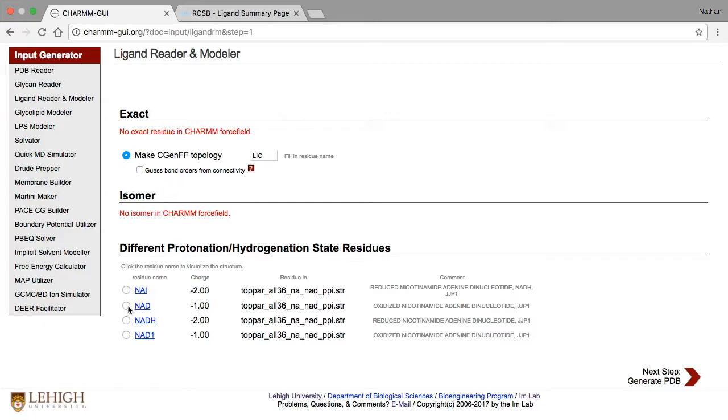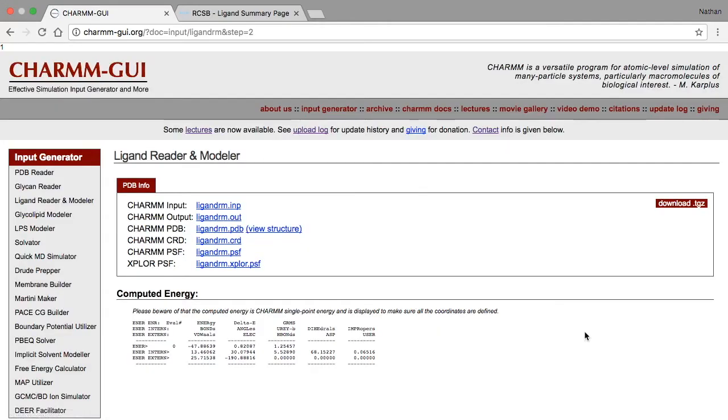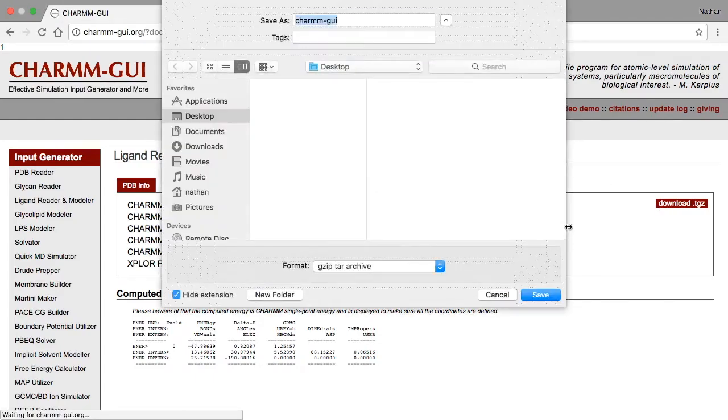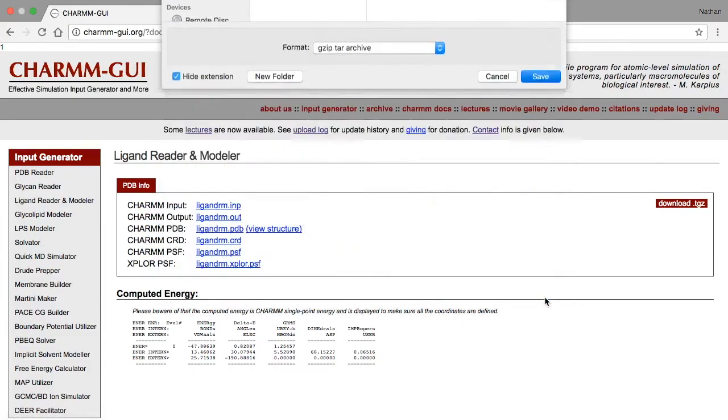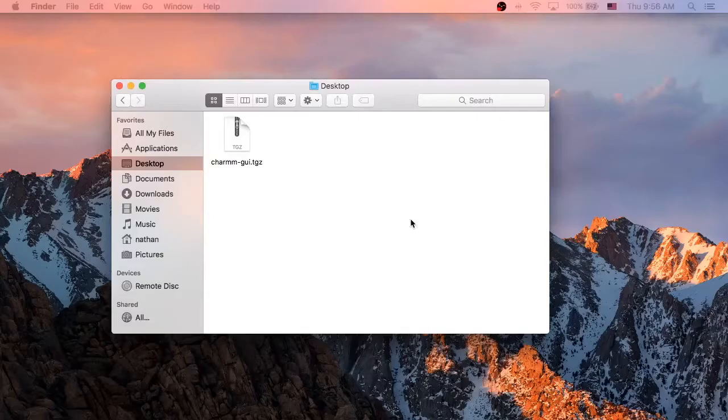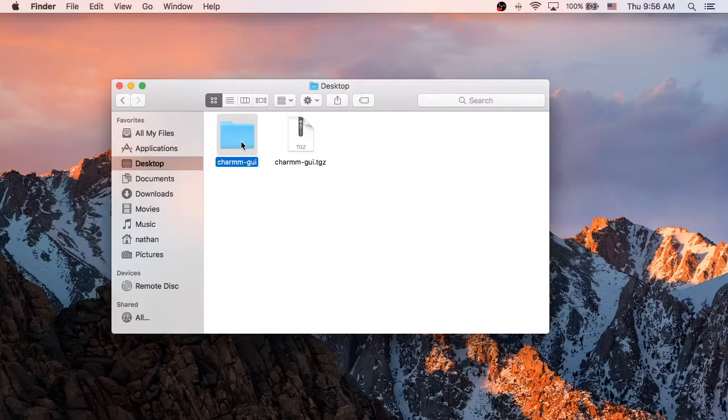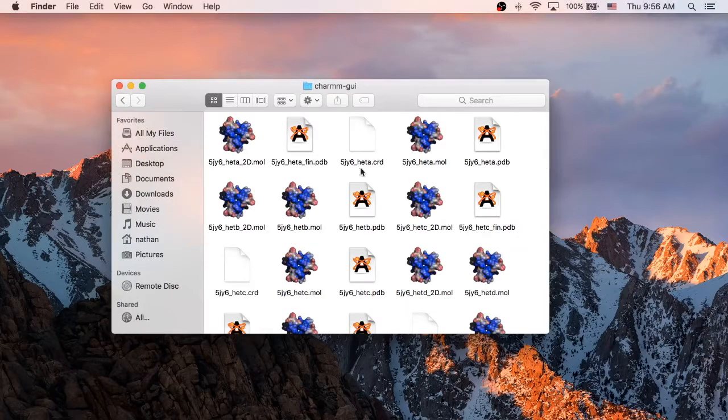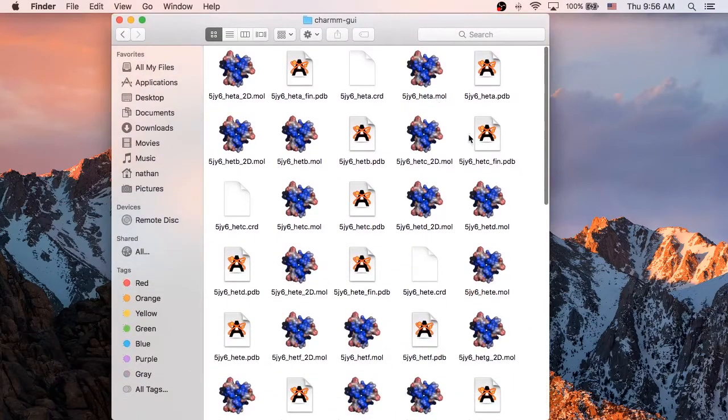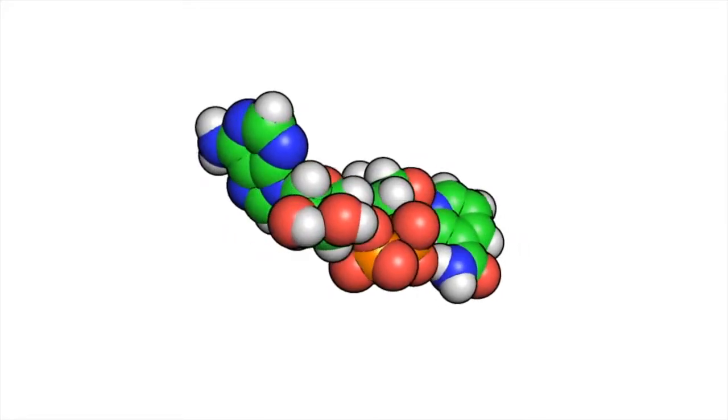Select one of the oxidized NAD molecules from the CHARMM topology, then click Next. More files are actually created by LigandReader and Modeler than are shown in this summary page. To see them, first download the structure, then extract the archive, and open the CHARMM GUI folder. In this case, 21 different PDB files were created.